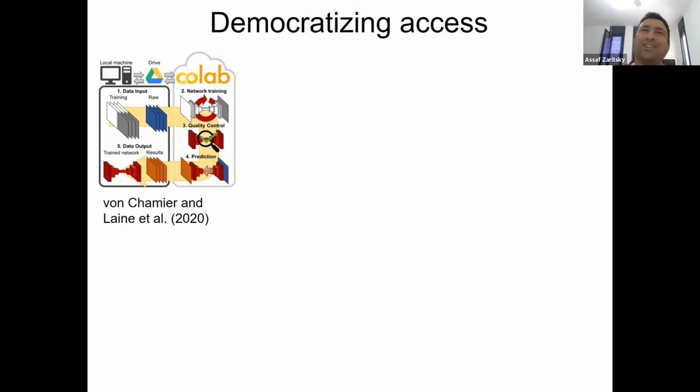They have a platform, and now they implement, like plugins, different networks to this platform, which allows you to use it on your data or train on your data, everything in the cloud, everything for free, etc. And it's not zero-shot learning. It's not a technique. The name is ZeroCostDL4Mic. Yeah, it's a complicated name. Zero Cost Deep Learning for Microscopy.